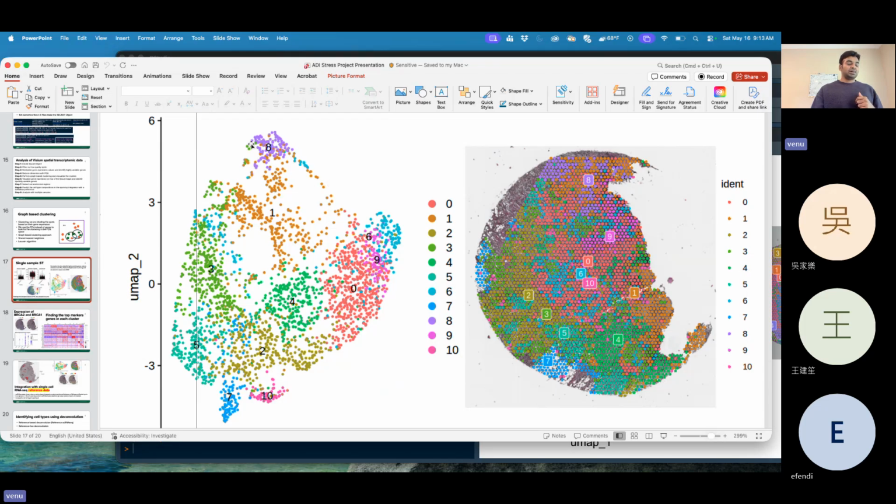if we don't get enough number of spots, it is very hard to validate that information. So in my previous study, I had 500 plasma cells in one group, but it is very hard for us to validate those 500 cells. If we have a good validation data set, that reveals that yes, these cells are true. But in spatial information, you always understand what the cell interactions are here. So within spot 8, there are two cells, and they are interacting with each other. One is a primary cell and another is a secondary cell.